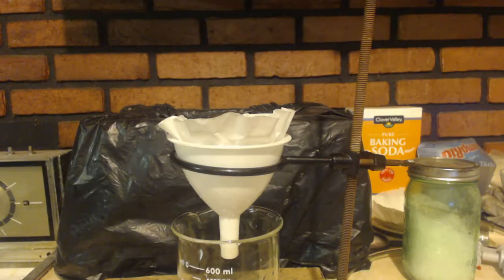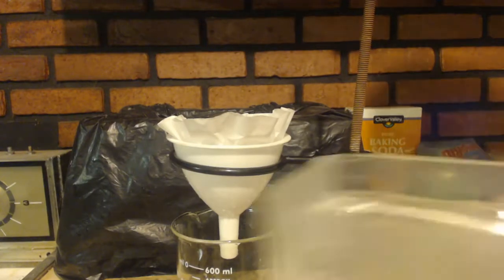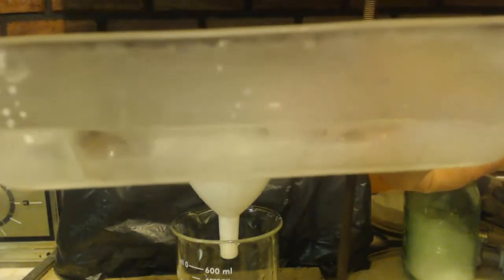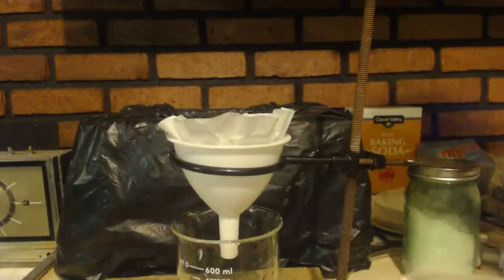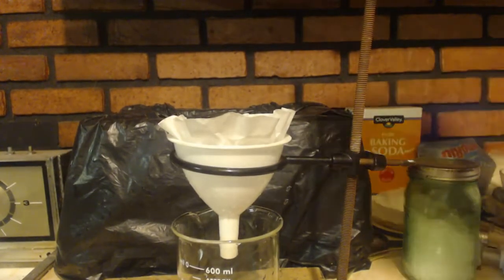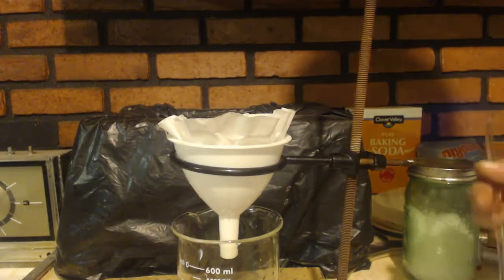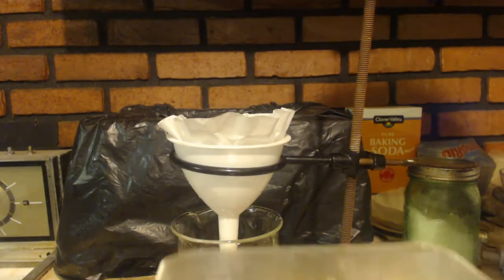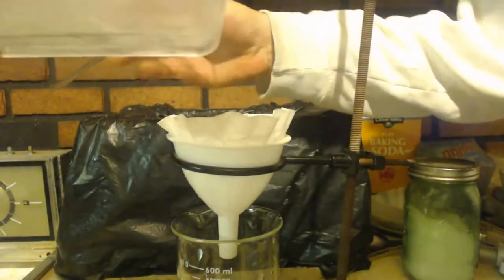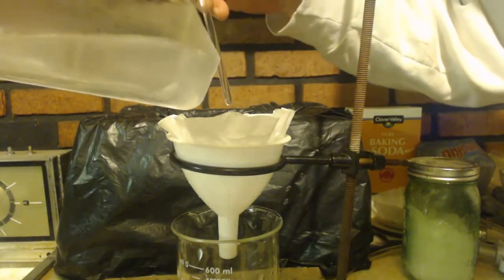I got to change plans. I think this is calcium sulfate that's coming out. Look how much water that is. That's like 300 milliliters. Now, I've only made about 27 grams of ammonium chloride. I only need maybe 35, 40 milliliters of water for it to dissolve. But there's no way anything can be coming out of solution yet. So I'm going to pour this in here and filter that out.